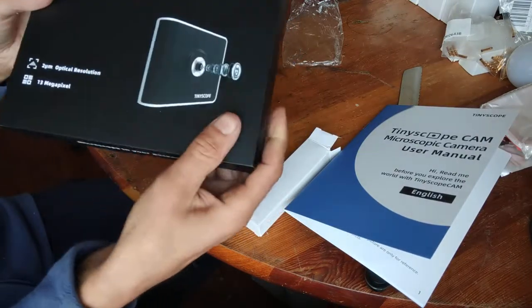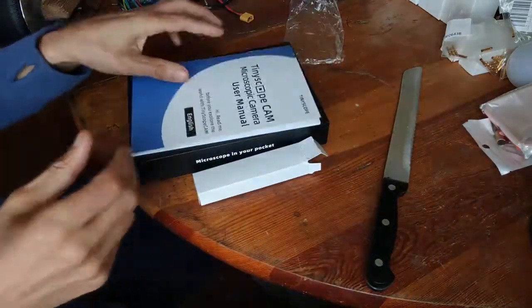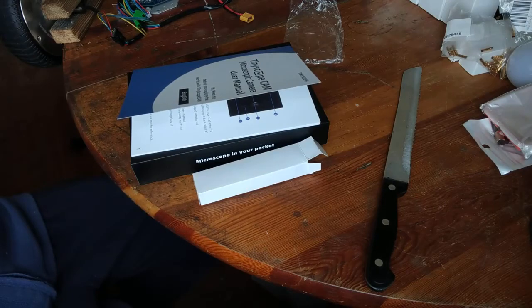A lot of comments say the image is just black and nothing shows. But the creator immediately offers to ship a second unit. I would advise the creator to ask users to upload a video showing how it didn't work, so people can't simply claim it's broken just to get a free replacement.